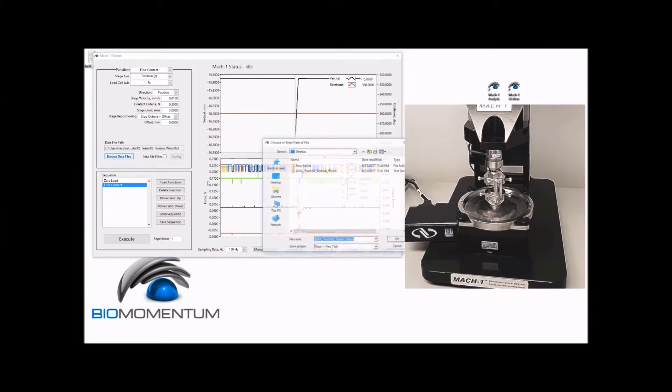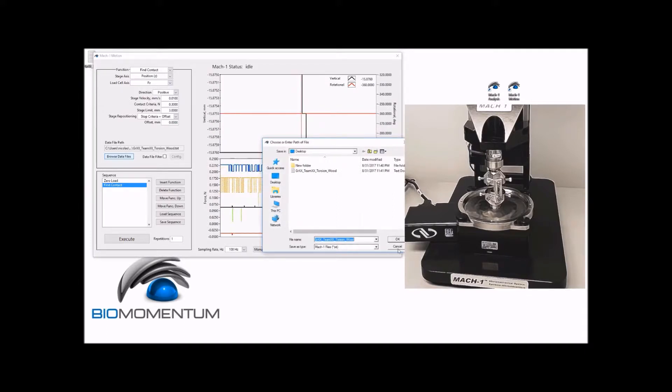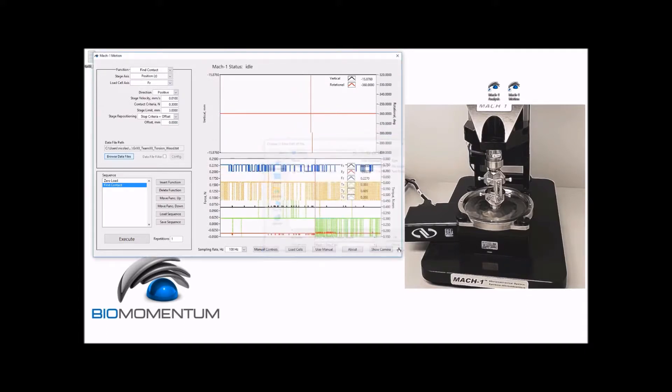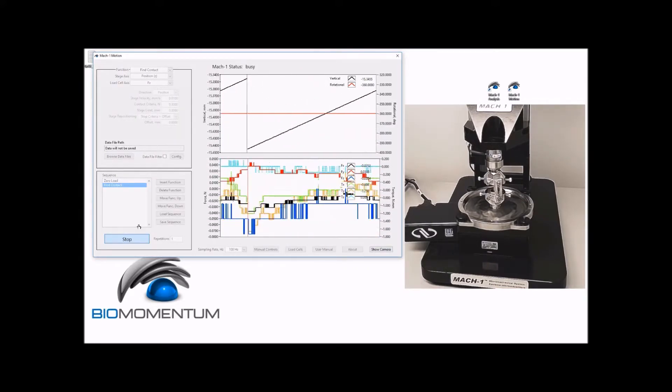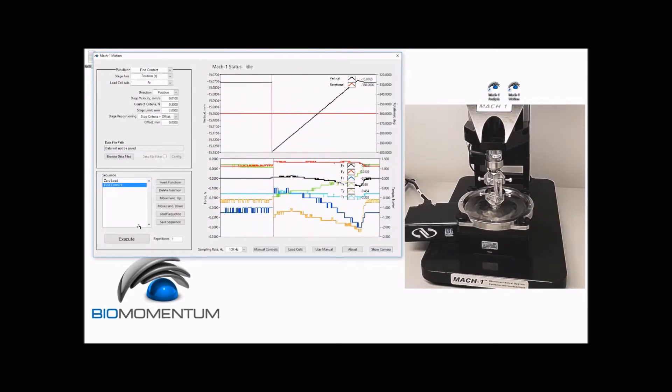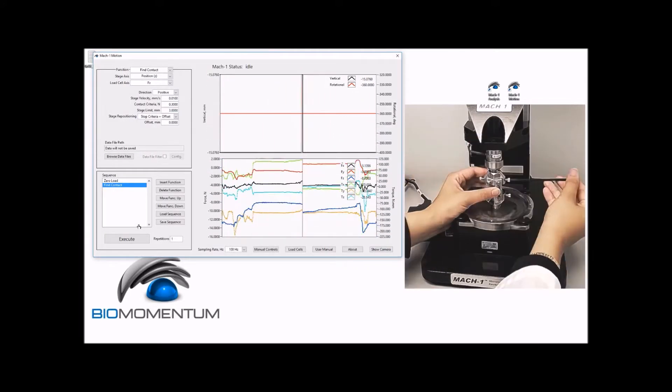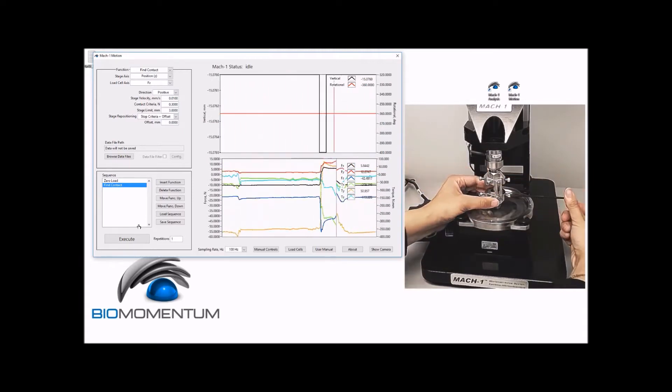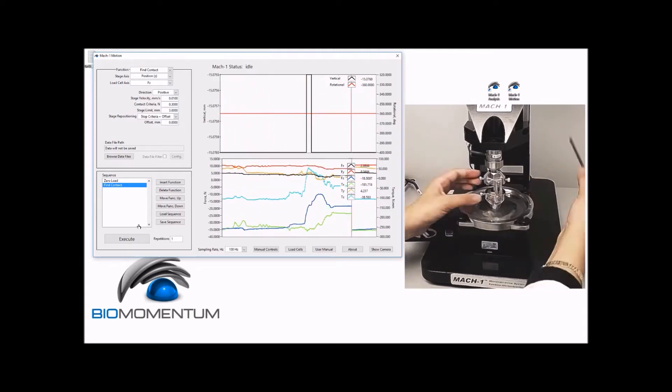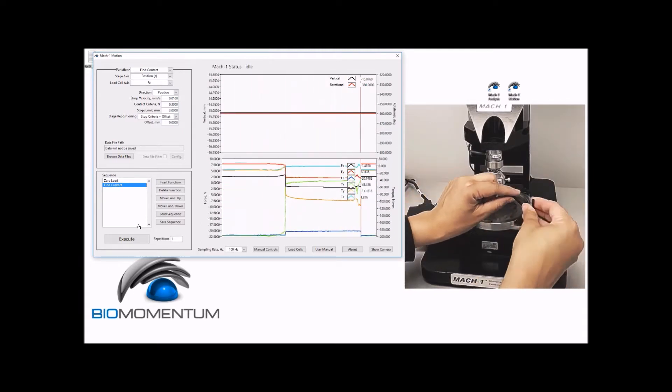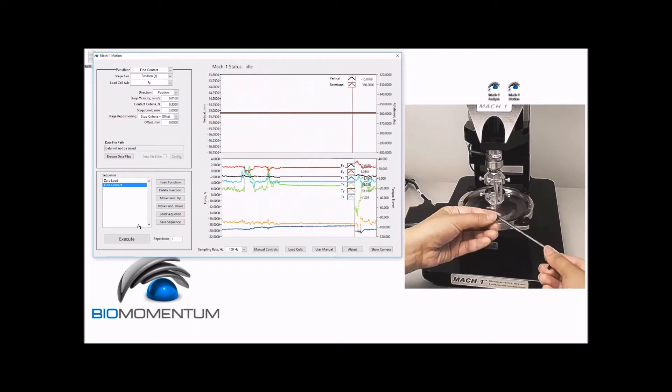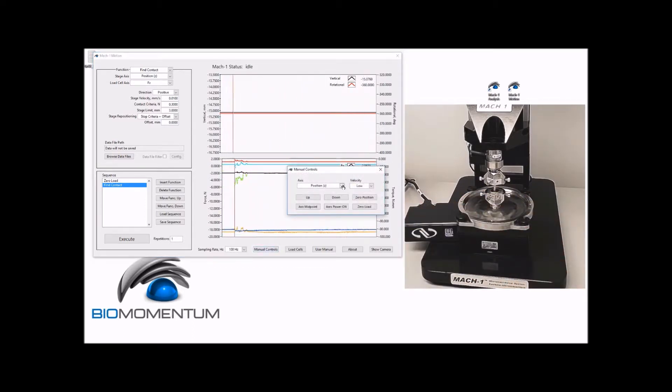Now we can execute the sequence. Then secure the torsion adapters in the torsion base using the two screws for each torsion base. Then remove the alignment mount.